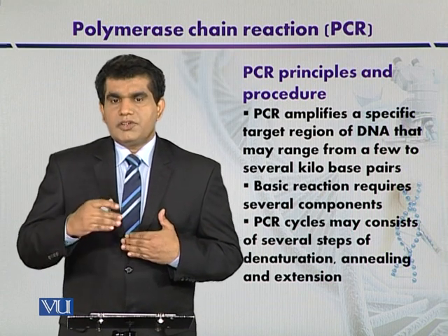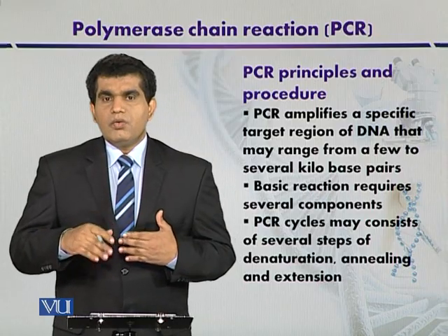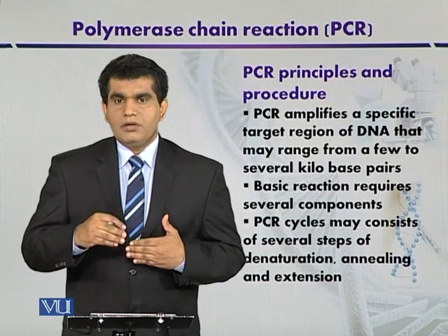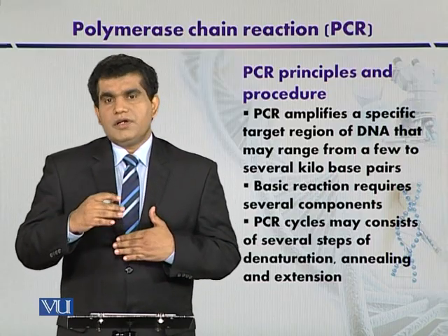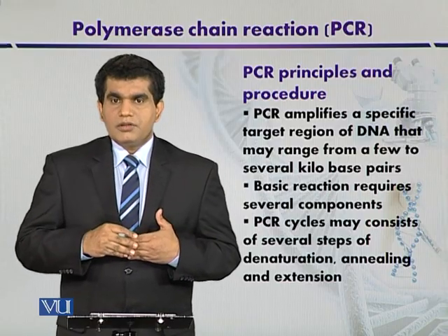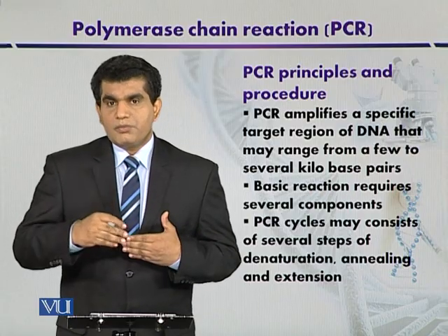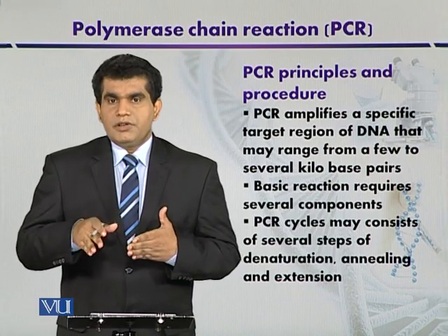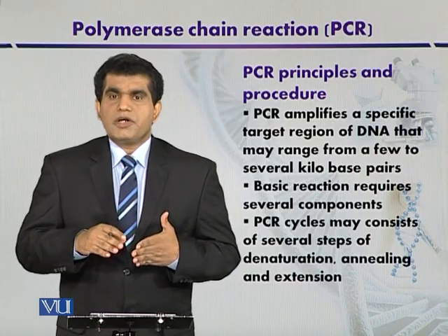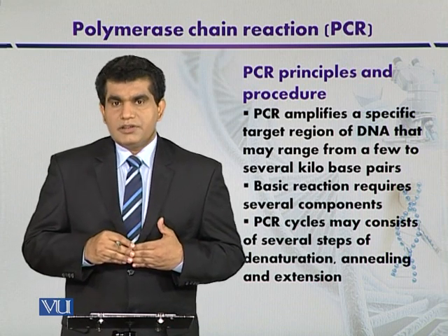And when all the steps are completed, the next step is holding the reaction mixture at low temperature. Low temperature means that when the reaction is completed, तो हमें इसकी स्टोरेज की ज़रूरत होती है. तो temporary storage के लिए हम amplified product को PCR मशीन में ही या थर्मोसाइक्लर में ही स्टोर कर सकते हैं at low temperature, like maybe 4 degrees Celsius.